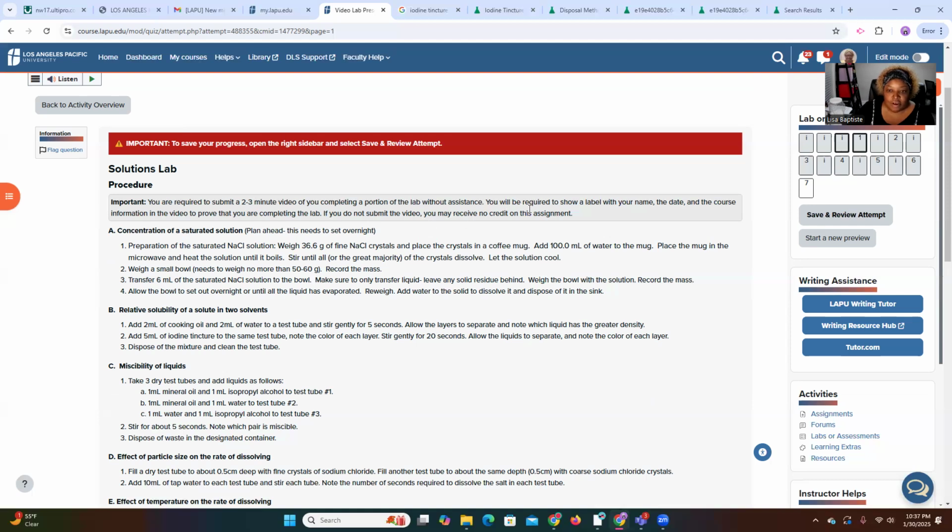All right. And then on this video, you do need to have a label that has your name, the date, and the course information. Something like this is CHEM 115, and you are working on the week 3 solutions lab. Okay, that's perfectly enough. Your name and the date. I suggest you put it on a note card.